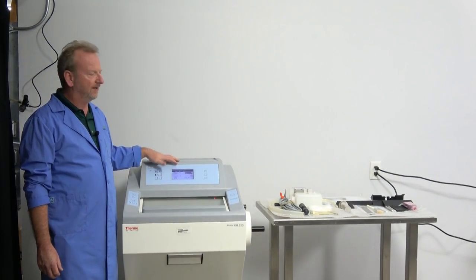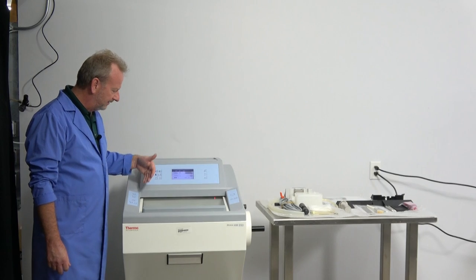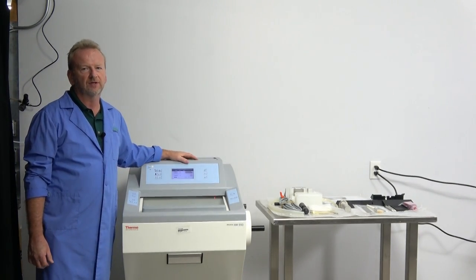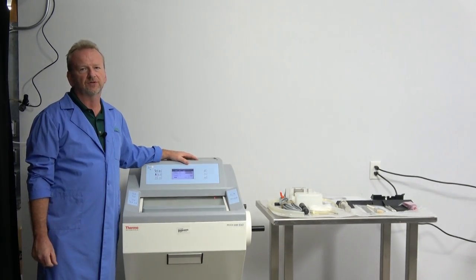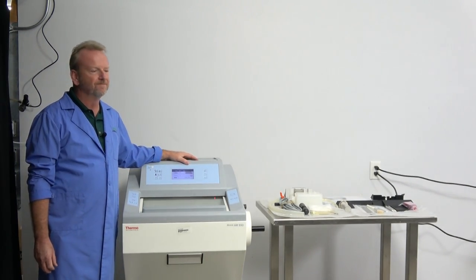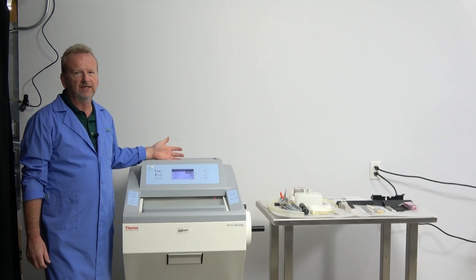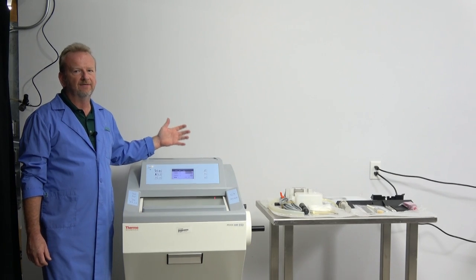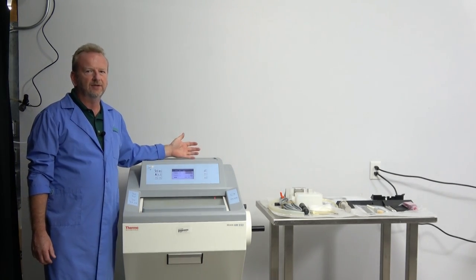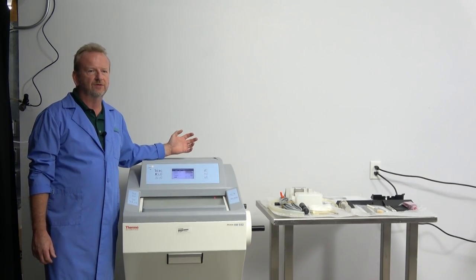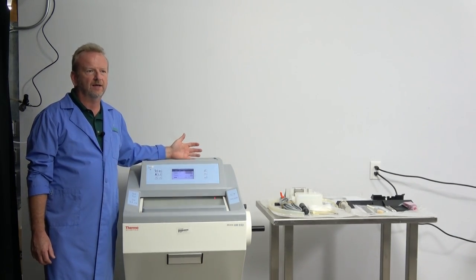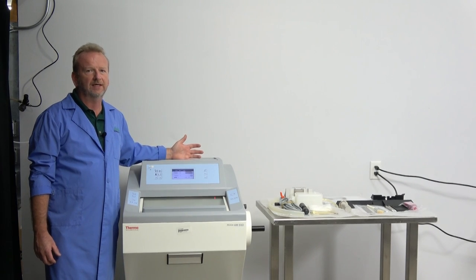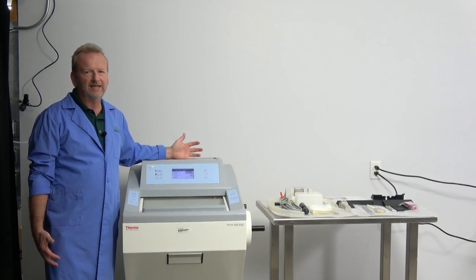And then like all models, it comes with the Peltier cooling also. But just a loaded machine, never had any use. It's still just been sealed up in a crate, had the plastic bag completely around it.